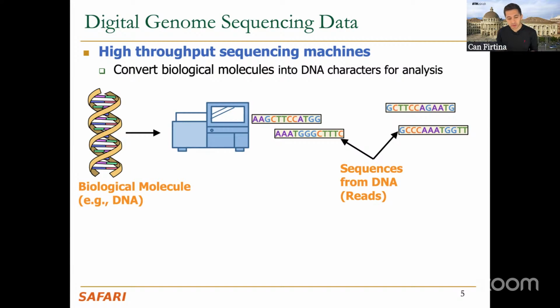To simplify it in your mind, you can just think of it as the fragmented molecule that is read by a sequencer as one piece. That is a read, essentially. I'm clarifying this because I've got several questions in the past about this, and it's not necessarily clear in the field, nor clarified in the field.